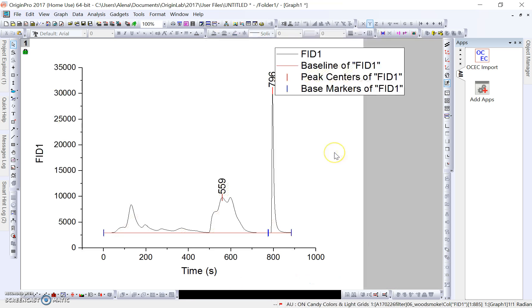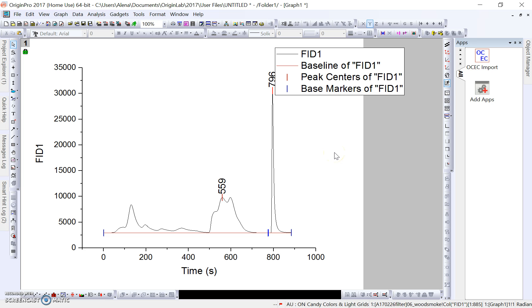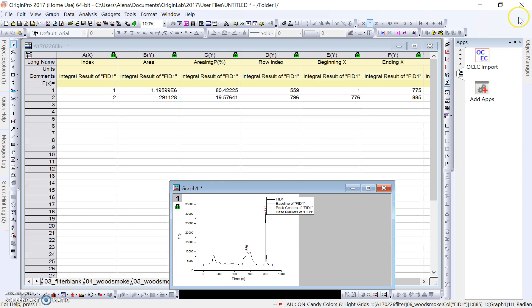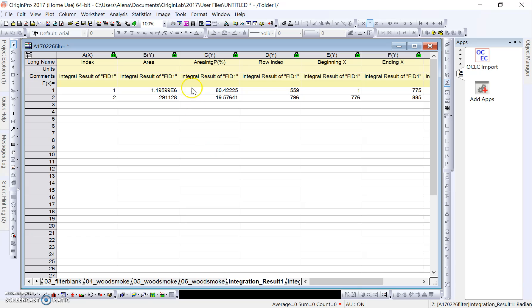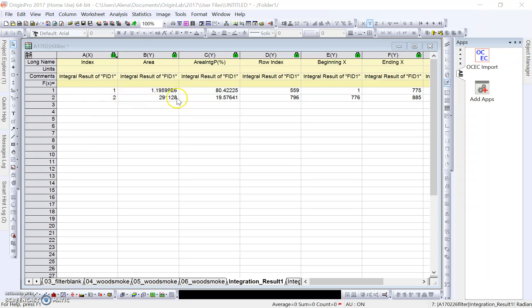Once we click Finish, the Origin software goes and calculates these peak areas. To be able to see them, we have to minimize our graph. Then it opens up this. As we can see at the bottom, it says integration_result1, which gives us our peak area of our range 1 and also our peak area here of our calibration peak, which is range 2.